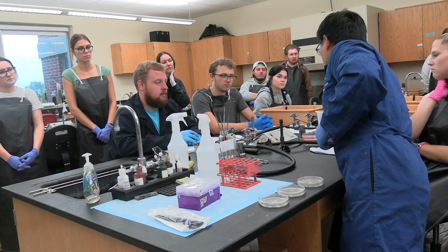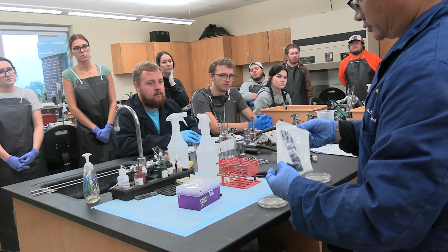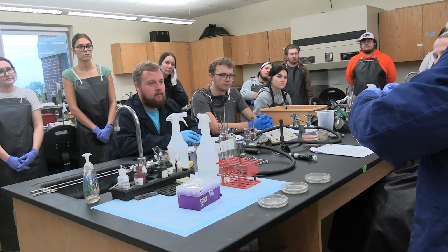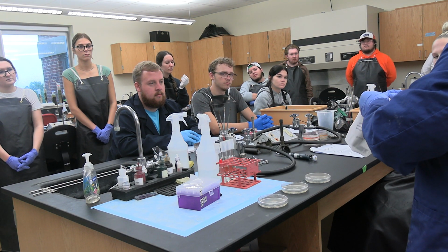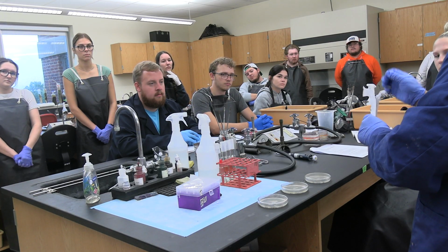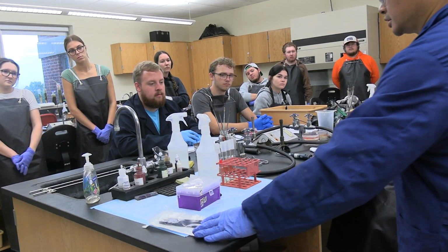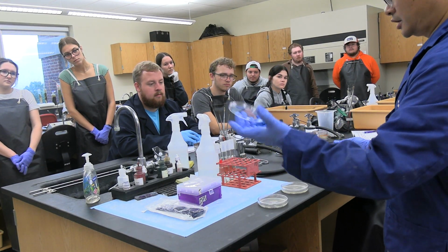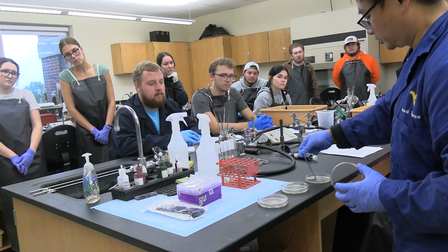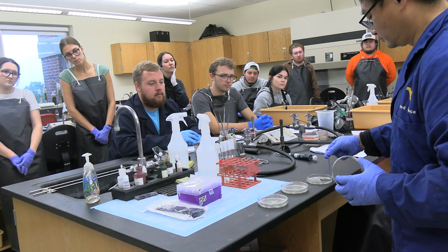Then, ready to do the spreader. How do we do the spreader? This is a disposable, sterilized plastic spreader. So make sure you only open a little bit. Take one, only need one, from high to lowest dilution. How do we do it? Have your hands here. This is called spread plating. Evenly spread on the surface.